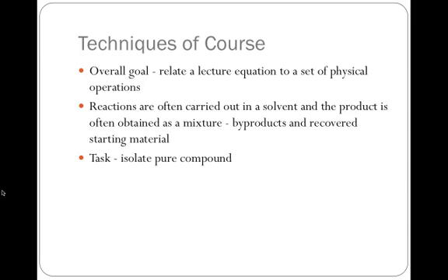In practice, reactions are almost always carried out in some sort of a solvent, and the product is usually obtained as a mixture. There may be recovered starting material, there are going to be byproducts of the reaction, and that solvent's going to be left over. The ultimate goal of a reaction is to actually isolate the desired compound in a reasonably pure form.